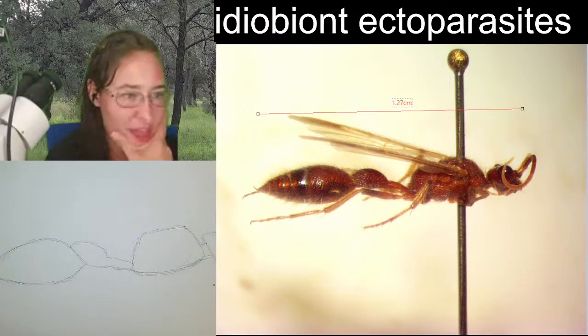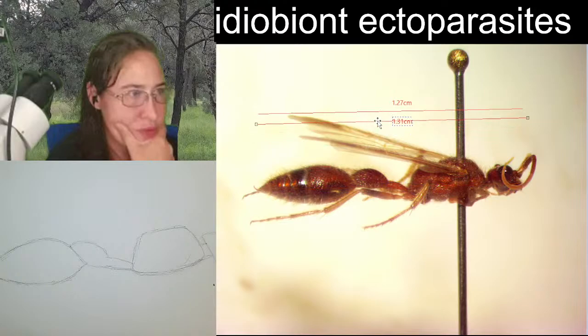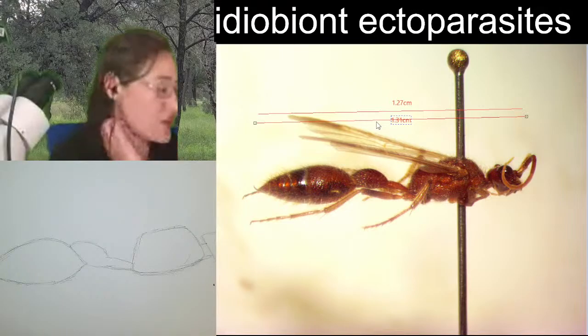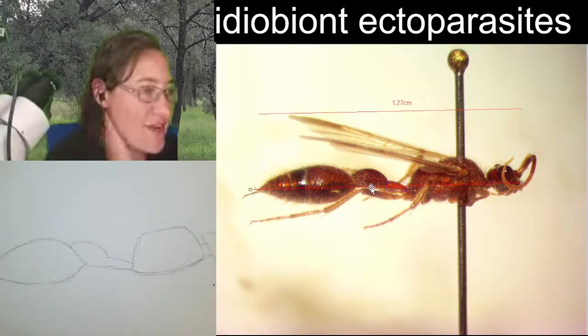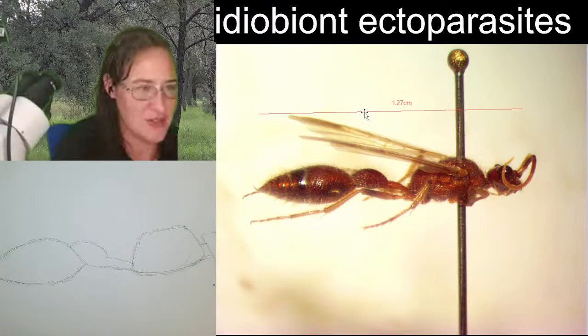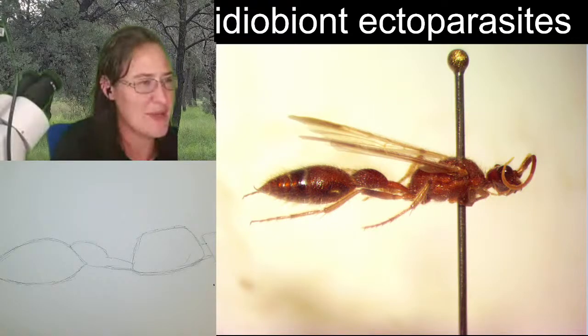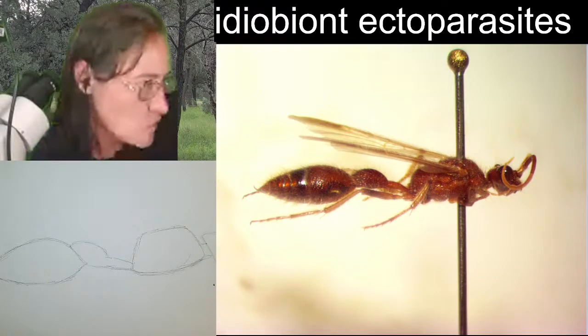And then with it, it is 1.31. So that measurement did not include the abdominal appendage. And if we do a little bit of math, it looks like the appendage might be something like 0.04 centimeters. Would that be a half of a millimeter? 0.4 millimeters?